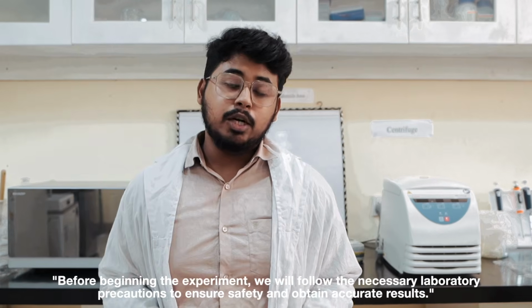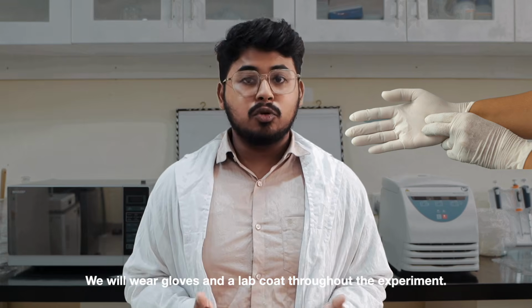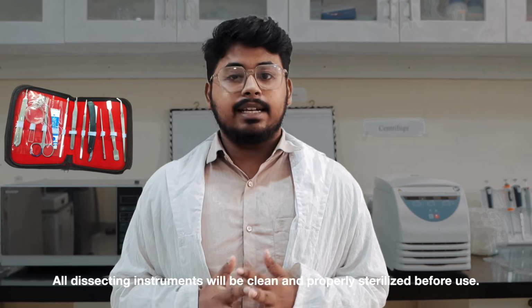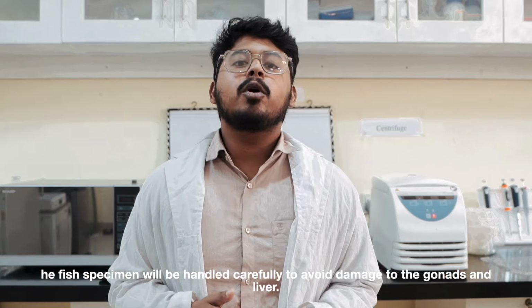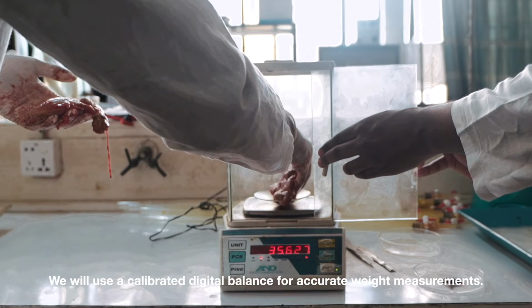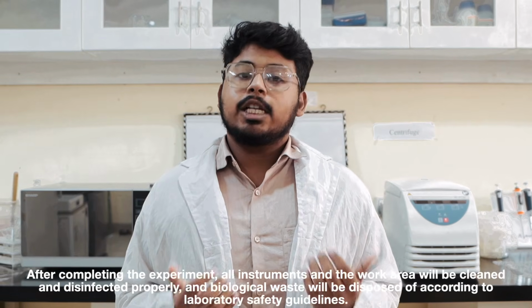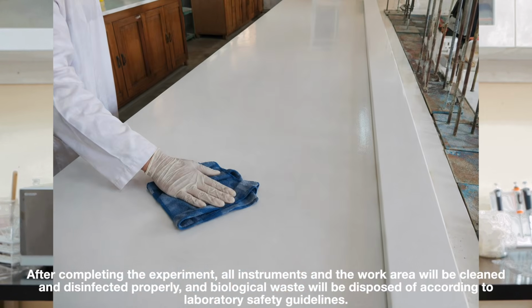Before beginning the experiment, we will follow some laboratory precautions to ensure safety and obtain accurate results. Firstly, we will wear gloves and aprons throughout the experiment. Secondly, all dissecting instruments should be clean and sterilized before using. Thirdly, the specimen should be handled properly to avoid contamination of the gonads and the livers. Then we will use a calibrated digital machine for accurate weight measurements. And lastly, after completing the experiment, our lab area and our instruments should be cleaned and sterilized properly following the laboratory guidelines.